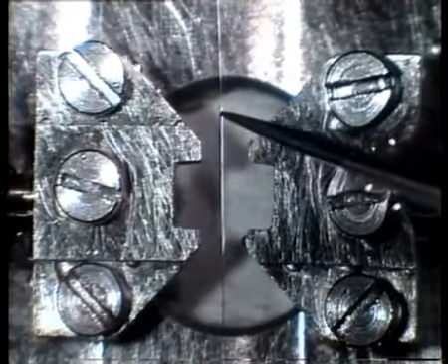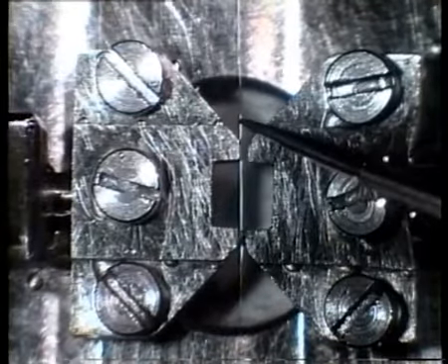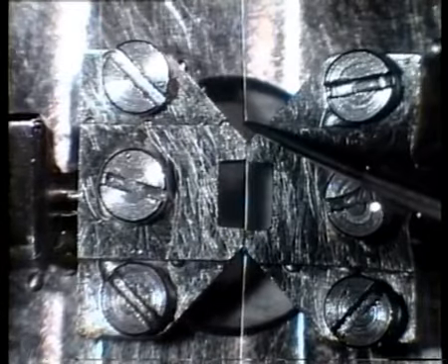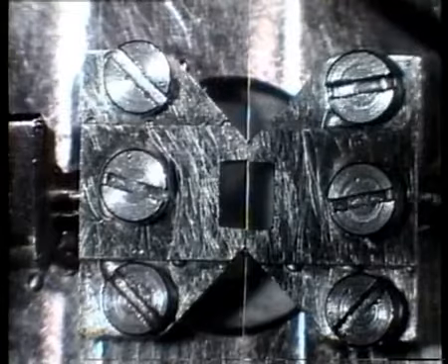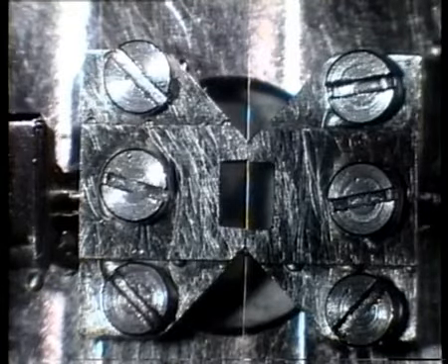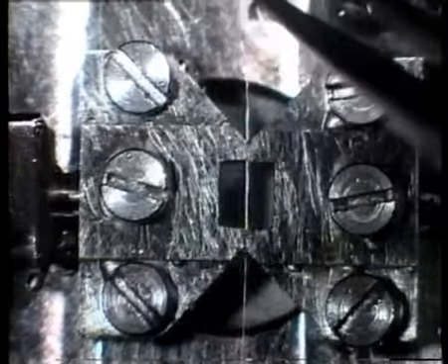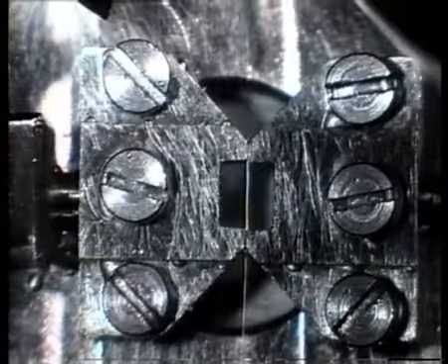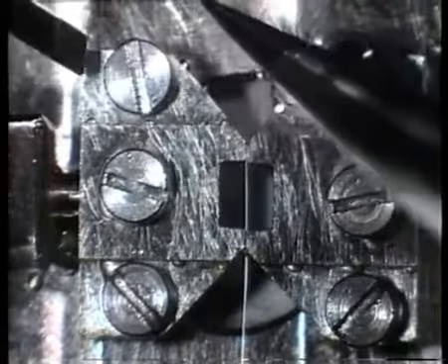The first wire is grabbed with the forceps 1/3 from the top and with an angle of around 45 degrees. It is then positioned and fixed between the mounting heads as shown. It should be placed between the heads so that there is enough wire on each side to reach the mounting screws. The top end of the wire is now bent and placed under the top left screw head, which is fixed gently with the screwdriver.